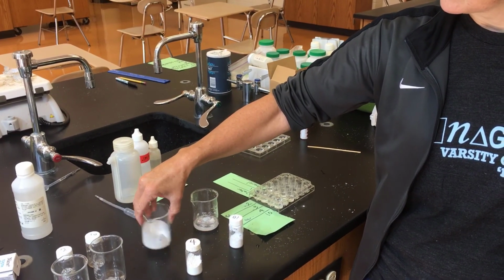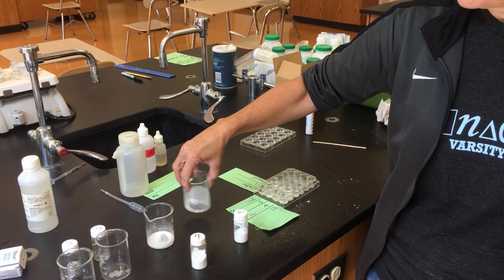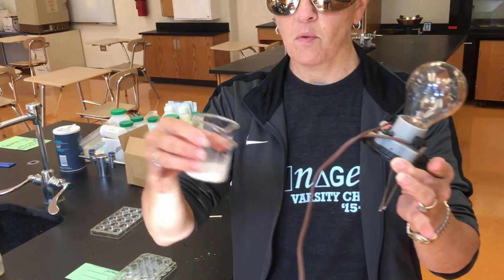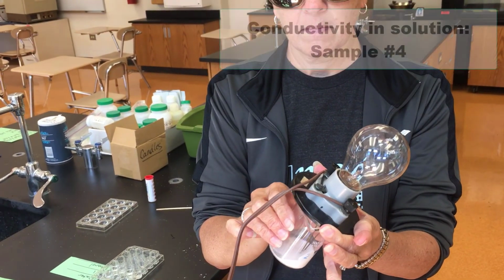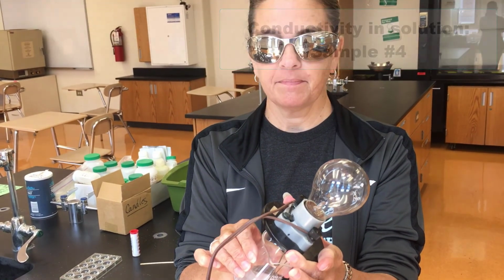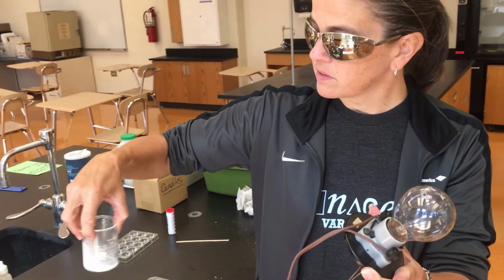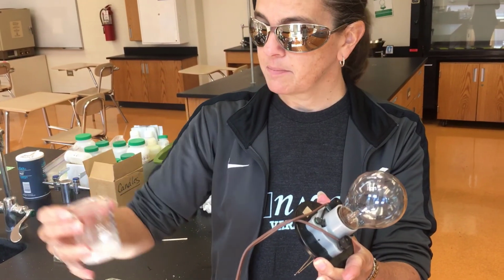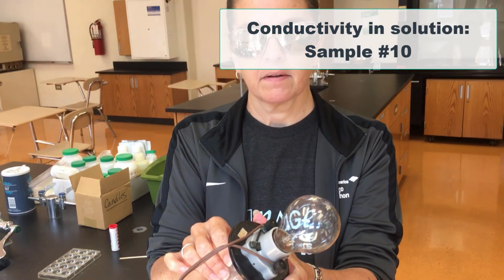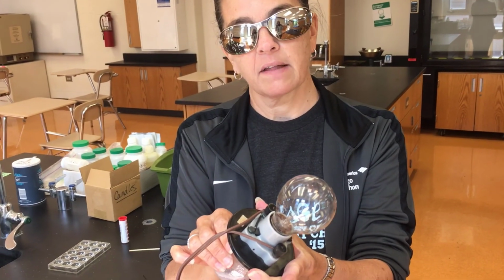Give them a good swirl. And here is sample 4. Yep. Nothing happening. And one more good swirl. Sample 10. Also a whole lot of nothing.